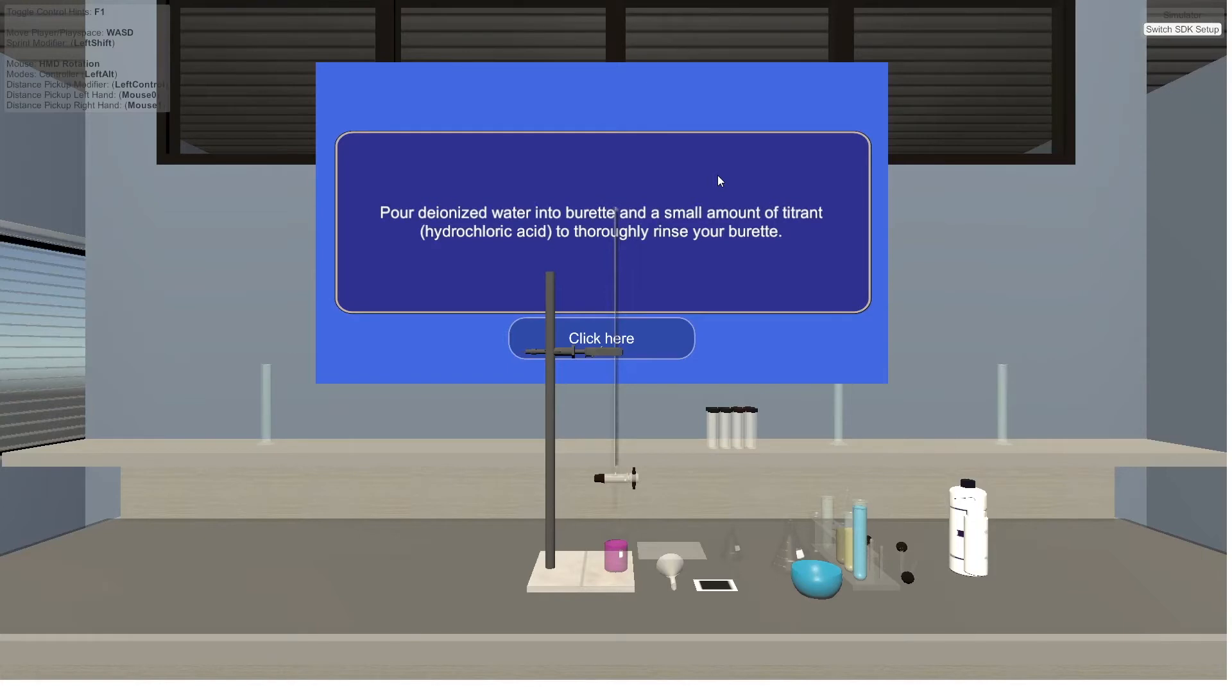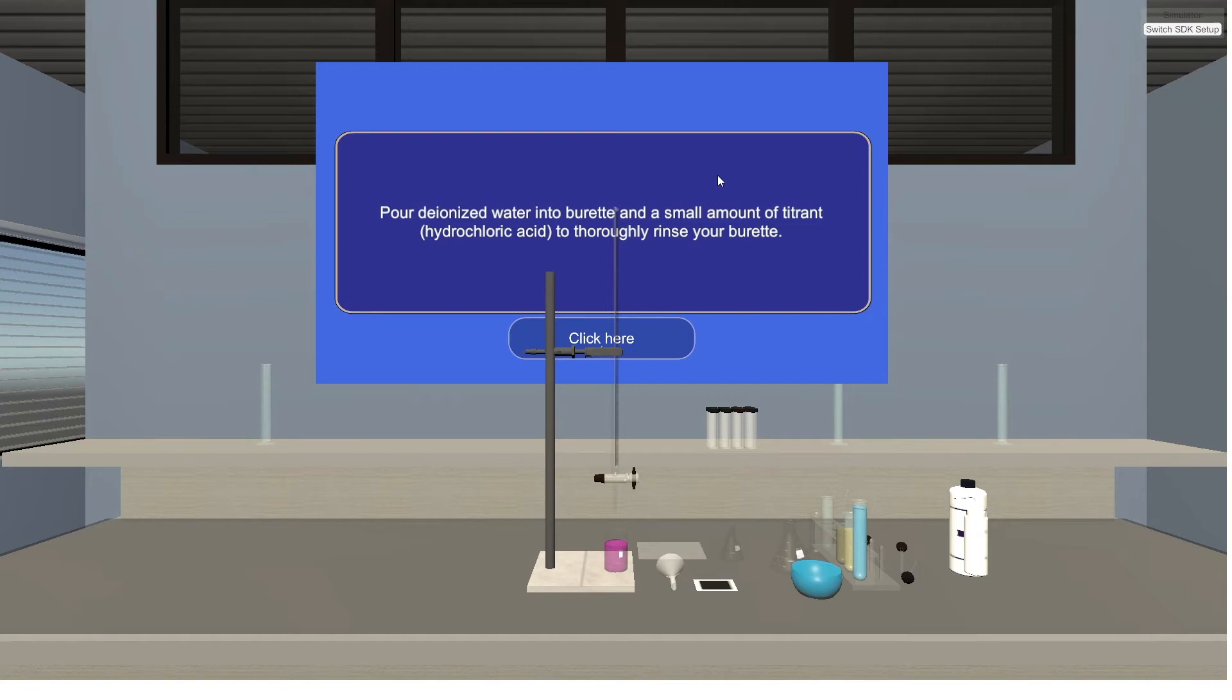Pour deionized water into burette and a small amount of hydrochloric acid to thoroughly rinse your burette.